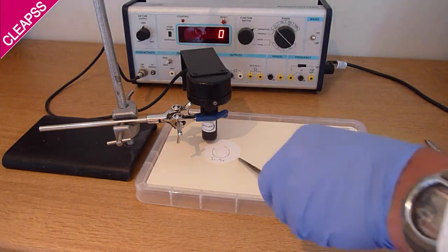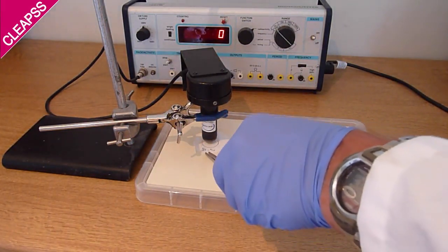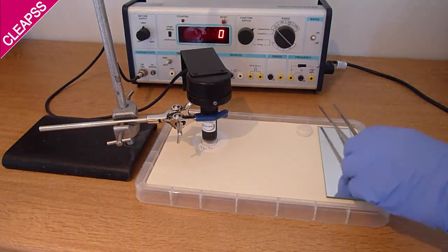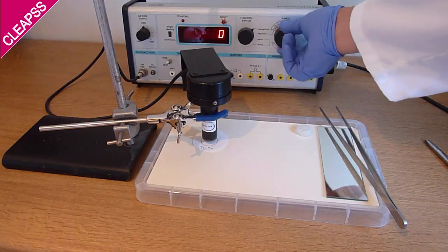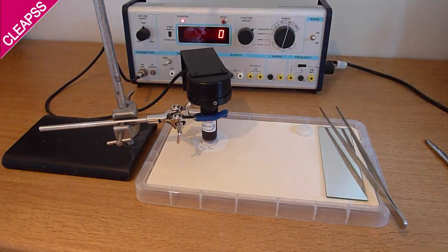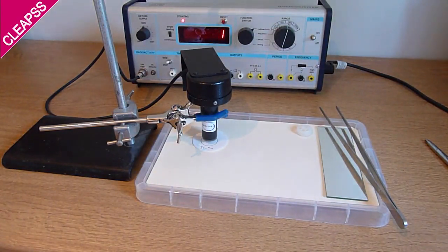Carefully slide the wipe underneath the GM tube, making sure the wipe doesn't touch the front window of the GM tube. Start the counter for 100 seconds and count.